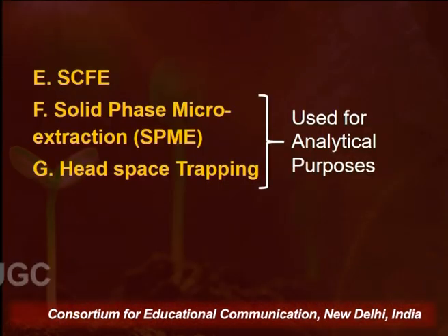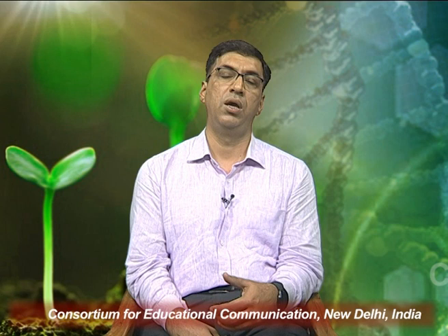Then solid phase micro extraction and head space trapping techniques are generally considered as analytical techniques, because the amount extracted is very less and that can be directly injected into analytical equipment like GCMS in order to have an analytical profile of the volatile oils.